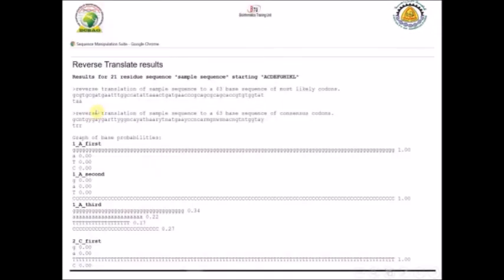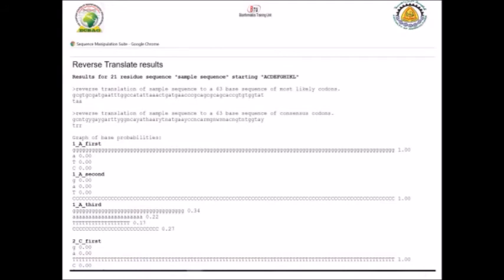After selecting your codon table, you submit your sequence and the program will return the predicted DNA sequence of your protein. Based on that, you can design your primers and use PCR to try to isolate the possible gene that produces this kind of protein.